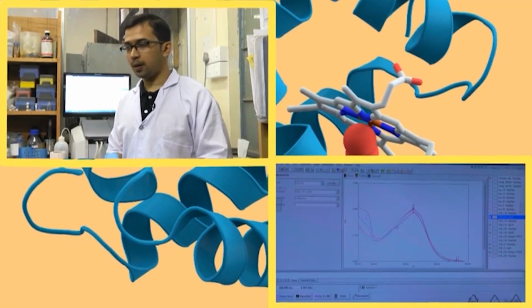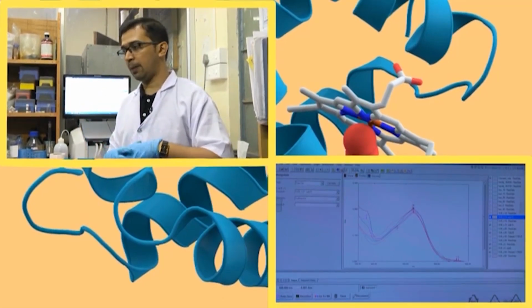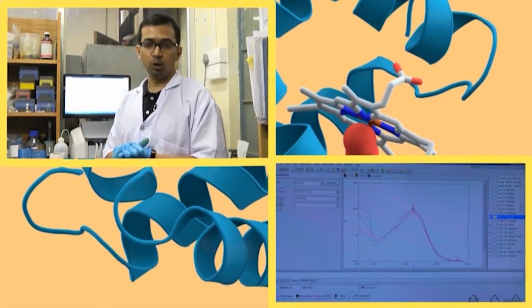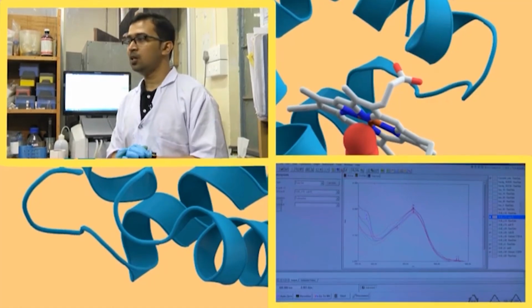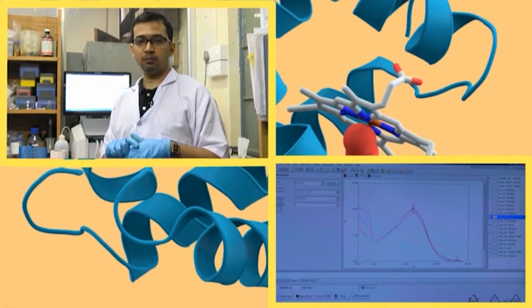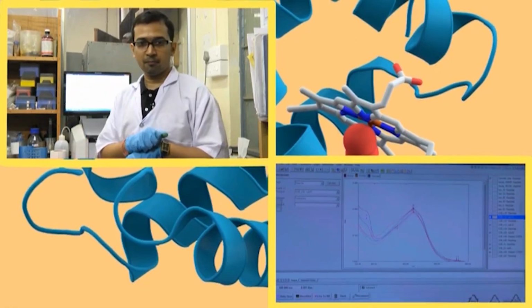And number two, another thing that might happen is with the curcumin which you have first in the beginning. Curcumin might not be completely soluble in water. Okay, there is a problem with curcumin, it is not completely soluble in water. So, when you are taking curcumin there, although you are mixing it, some fractions during the scan are getting precipitated.